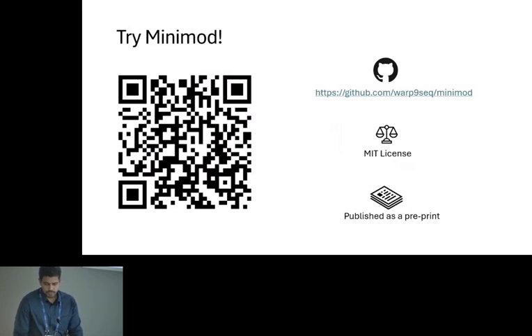And you can try Minimod, which is also provided in GitHub as open source and publicly available under the MIT license. And if you want to read more about it, we are going to publish a preprint pretty soon.